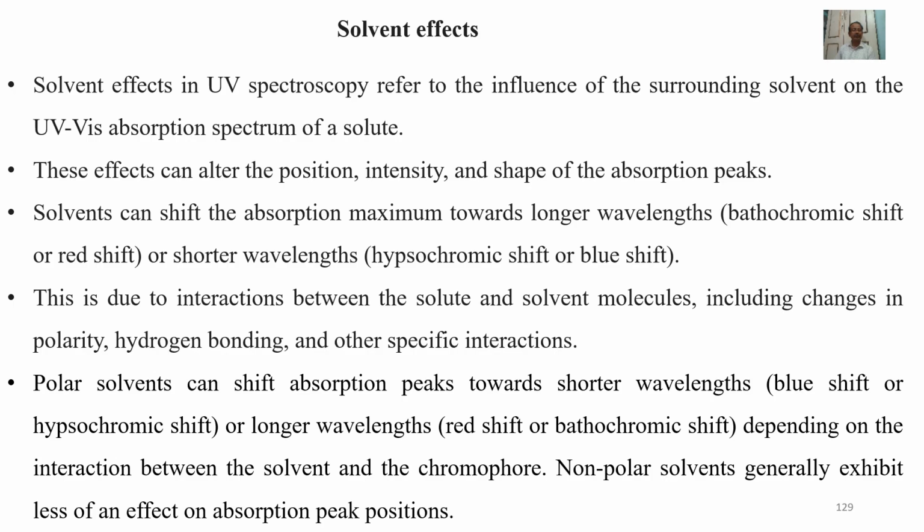This is due to interactions between the solute and solvent molecules, including changes in polarity, hydrogen bonding, and other specific interactions. Polar solvents can shift absorption peaks towards shorter wavelengths, blue shift or hypsochromic shift, or longer wavelengths, red shift or bathochromic shift, depending on the interaction between solvent and the chromophore. Nonpolar solvents generally exhibit less of an effect on absorption peak positions.